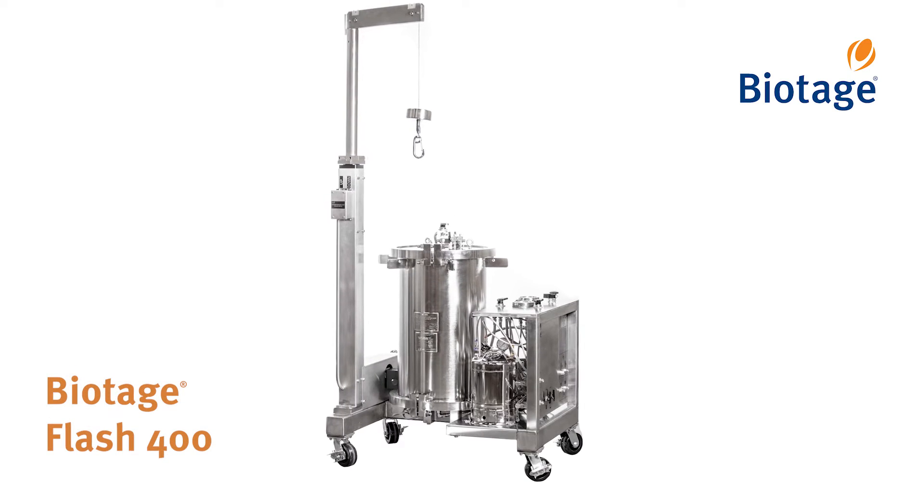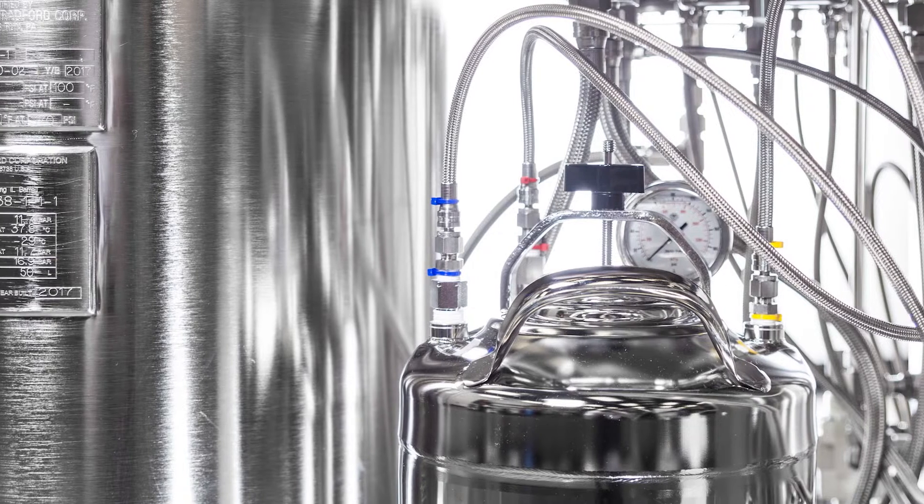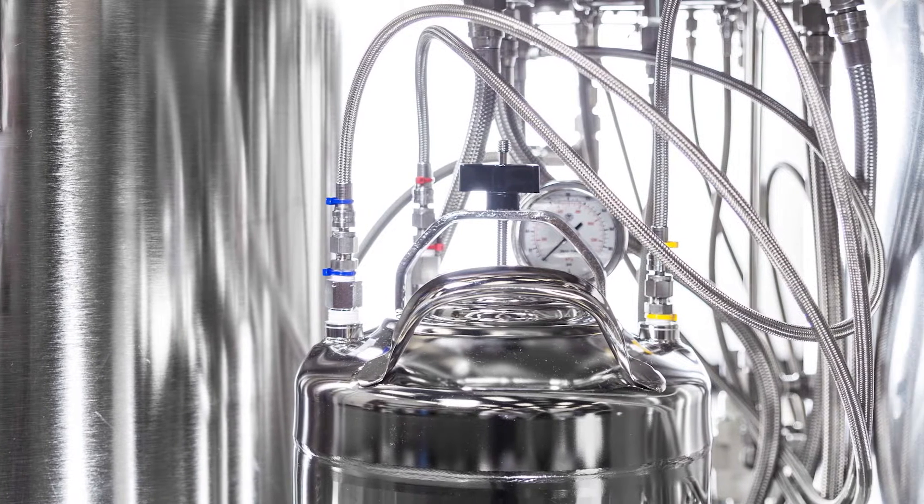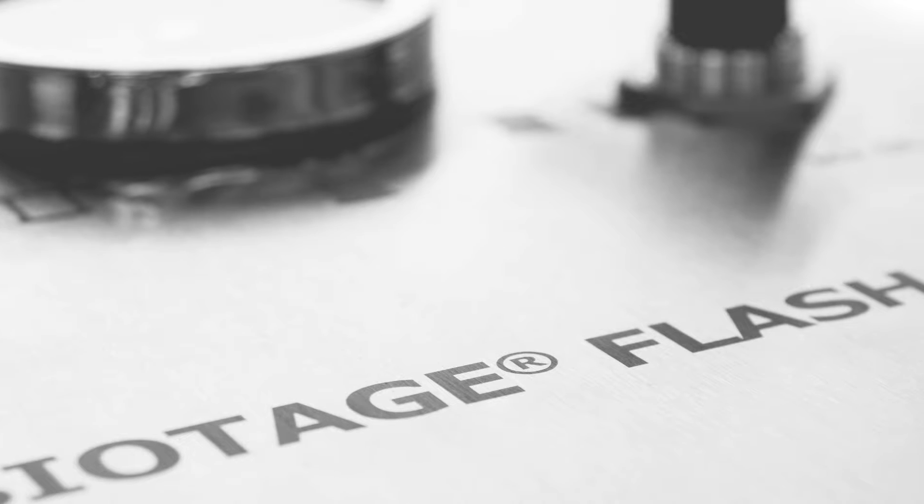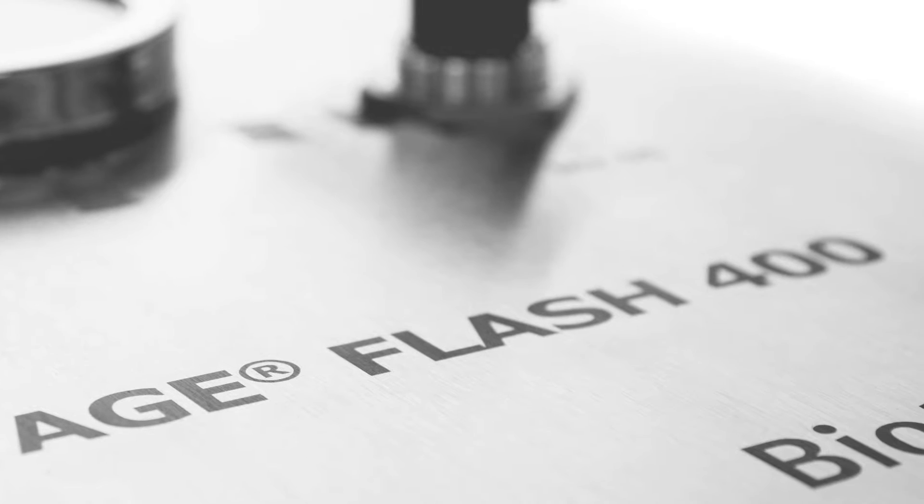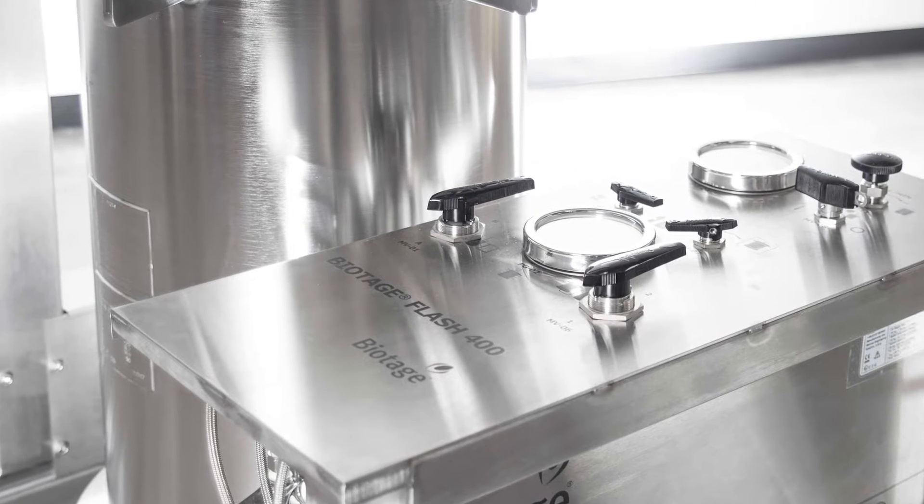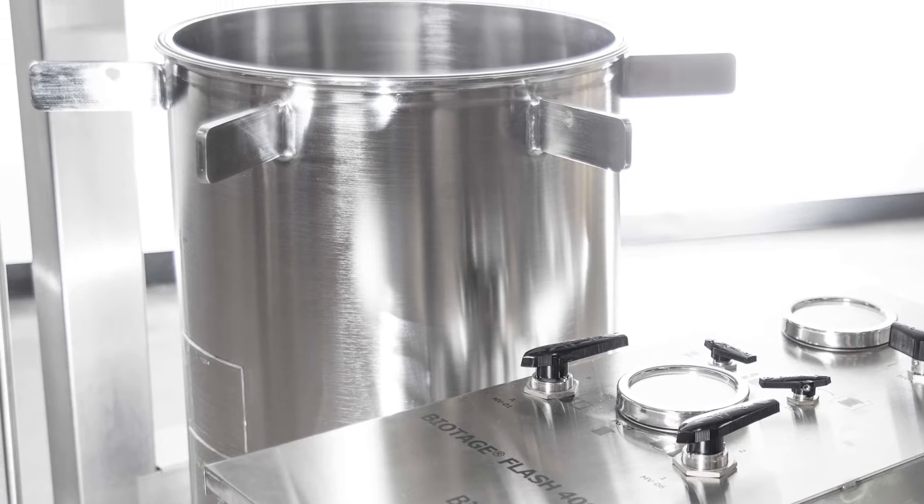Biotage Flash 400 is an industrial purification system for up to eight kilograms of material. With its solid engineering, minimal maintenance, and compliance with regulatory standards, it has become the first choice of pharmaceutical and contract manufacturing companies for critical purification applications around the world.